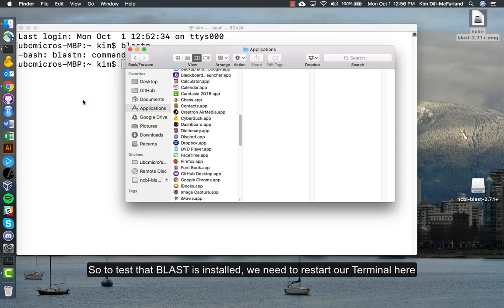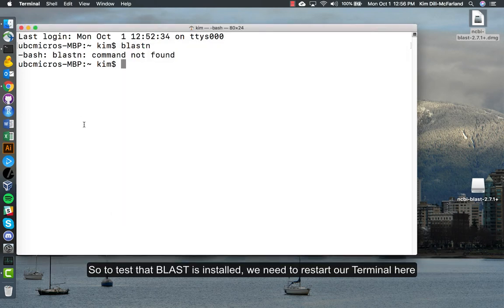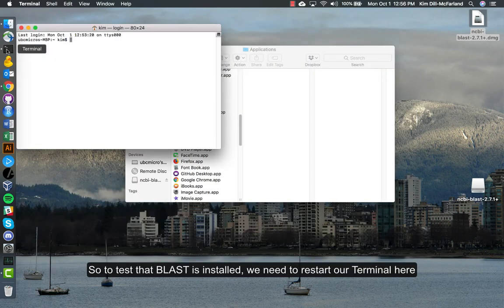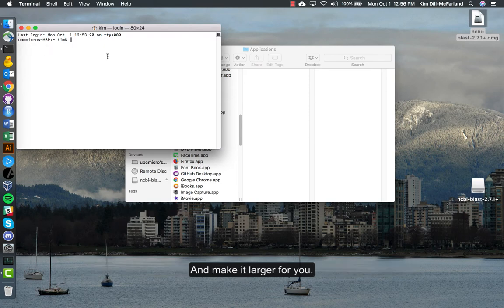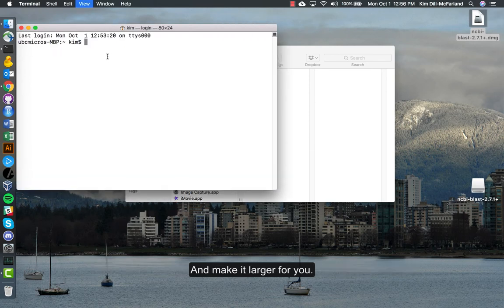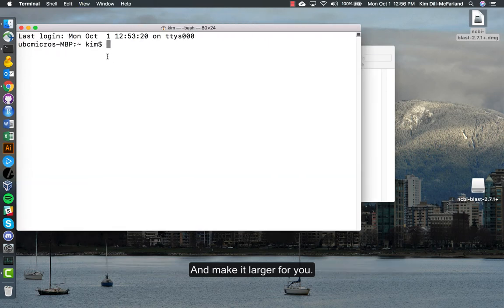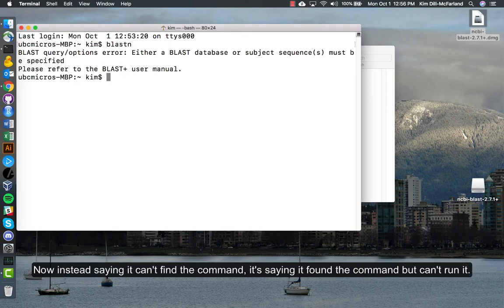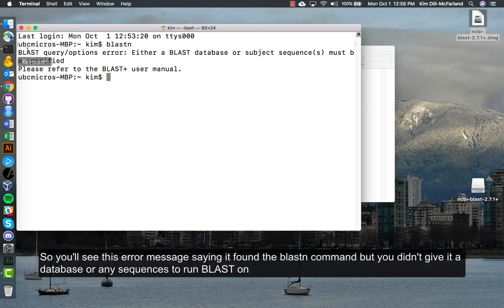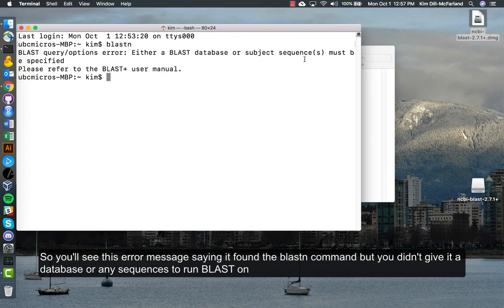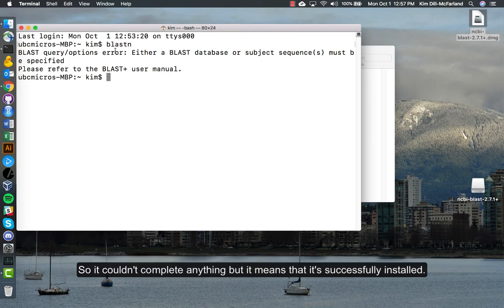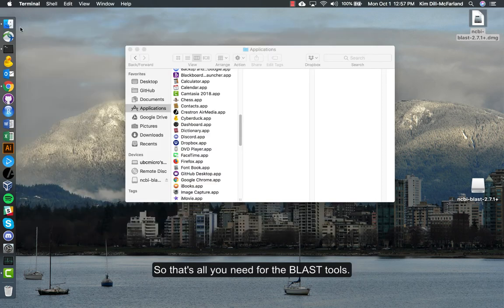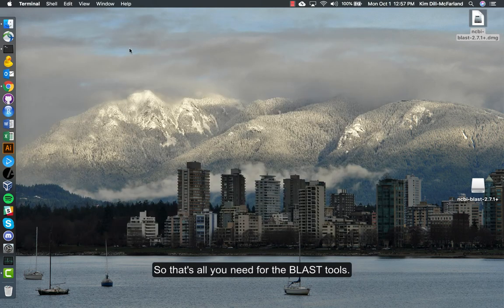To test that BLAST is installed, we need to restart our terminal here. Make it larger for you. Now when we type blastn and hit enter, instead of saying it can't find the command, it's saying it found the command but can't run it. You see this error message saying I found the BLAST command but you didn't give it a database or any sequences to run BLAST on, so it couldn't complete anything. But it means it's successfully installed. So that's all you need for the BLAST tools.